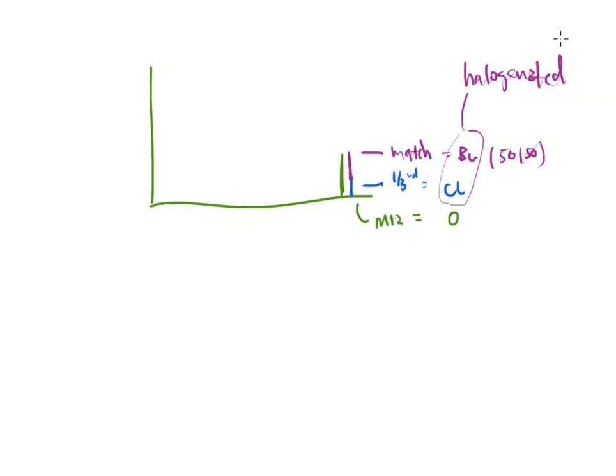And this is a way that I can quickly determine if the molecule that we shot into the mass spectrometer is a halogen or not. Look at the M plus 2 peak. How high is it? If it's super tiny, then no, they're not there. If it's about 1/3 of the height, then yes, chlorine is going to be present. And if it matches the height, it's a very good sign that bromine is attached to the molecule.